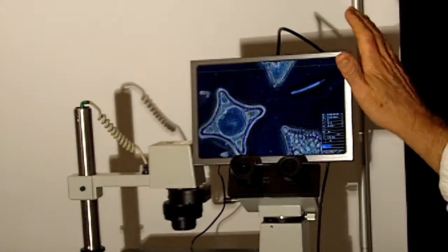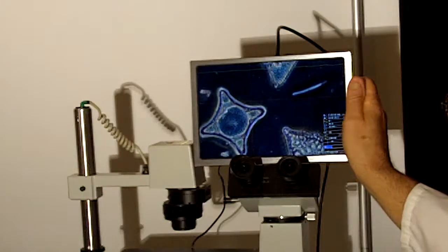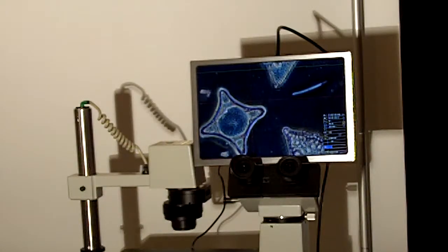This is the 9015. It's very reasonably priced and features a C-mount, so it's not proprietary to any particular microscope. Please feel free to contact us for detailed information, pricing, or your closest retail dealer. Thank you.